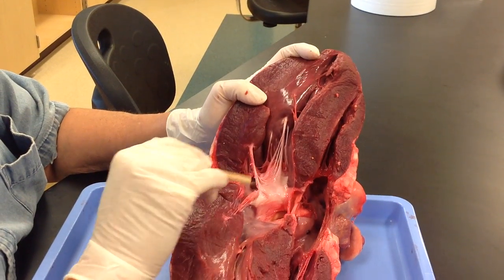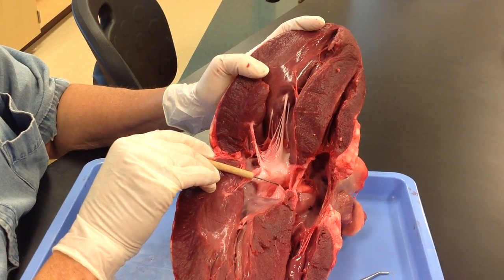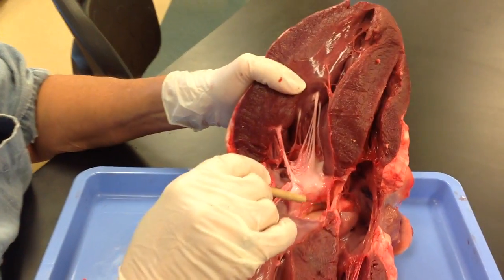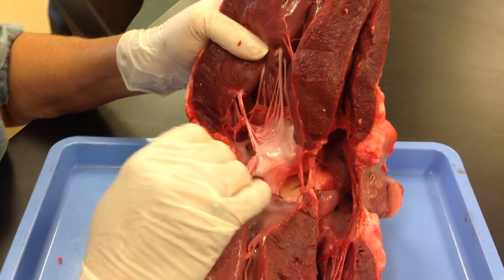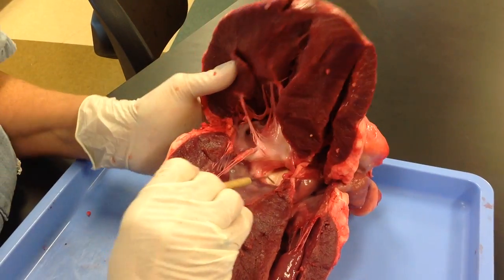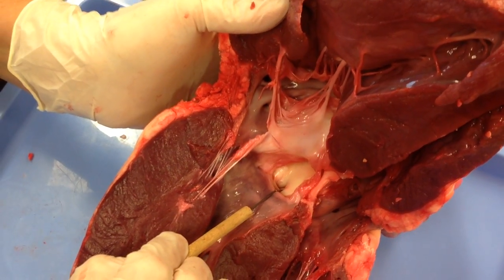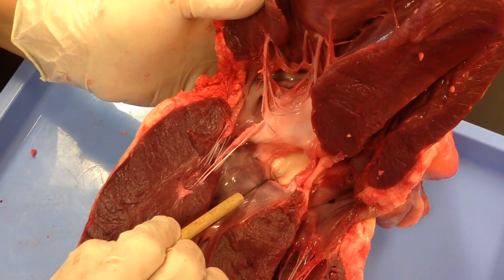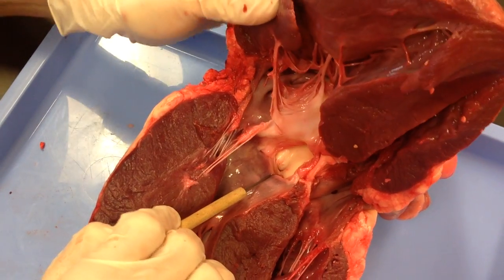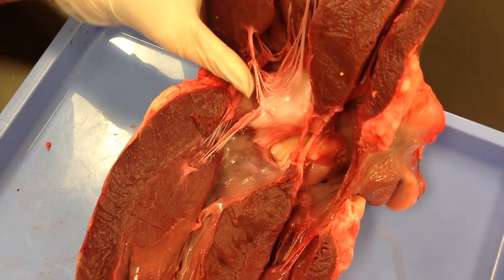Next to your bicuspid valve, you have your first semilunar valve — no chordae tendineae. This is your aortic semilunar valve; it is at the base of the ascending aorta. Also at the base of the ascending aorta, you can see these holes — those are where your coronary arteries arise. You want the highest pressure and the highest oxygen blood feeding your heart, so those are where your coronary arteries arise from.